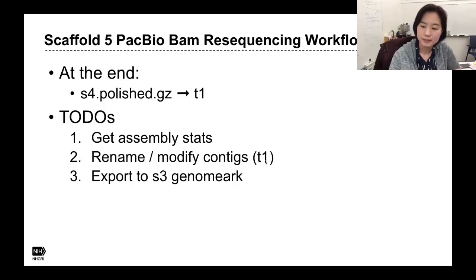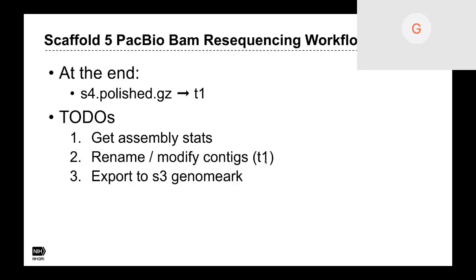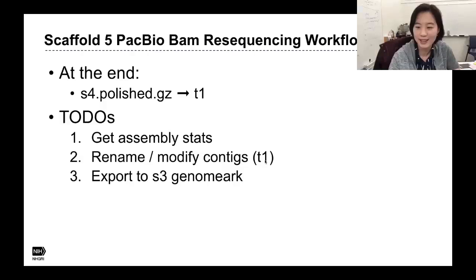I have a general question here. Apparently, at every step of scaffolding, you are required to rename scaffolds. Is there a specific reason for that? Isn't it possible to make it automated? Because I suspect that could generate some problems for the more general public if they want to work on it. Yeah, that's a good idea. I think we can do that.